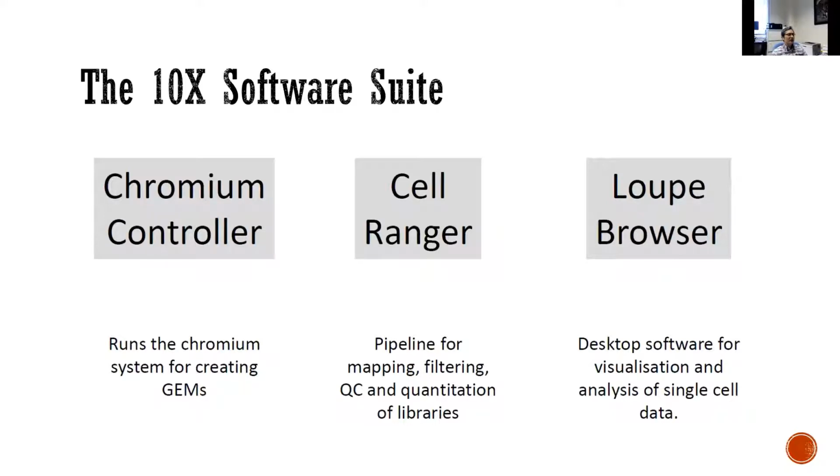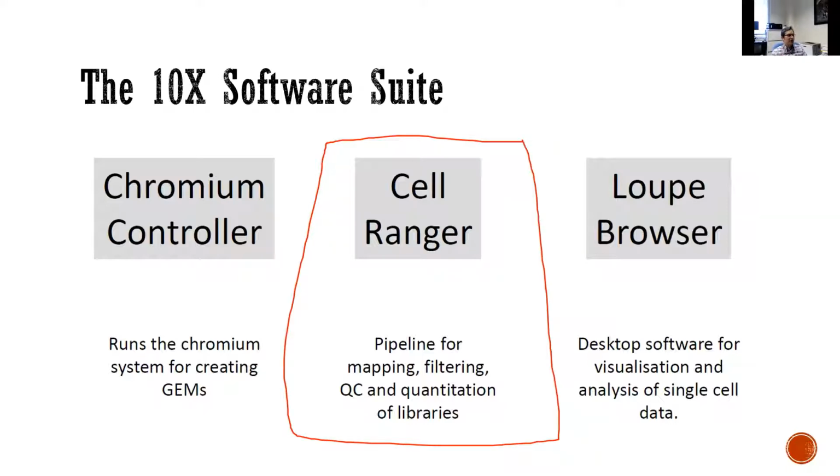Once you have got your sequence, say from the controller, the software we are going to use, provided by 10x Genomics, is called Cell Ranger.